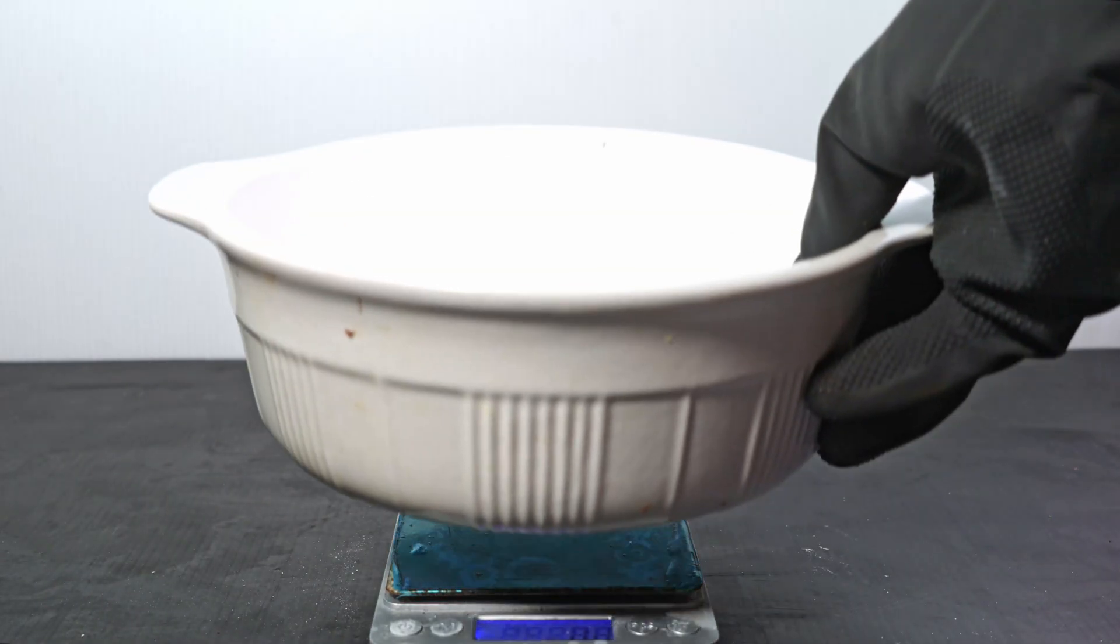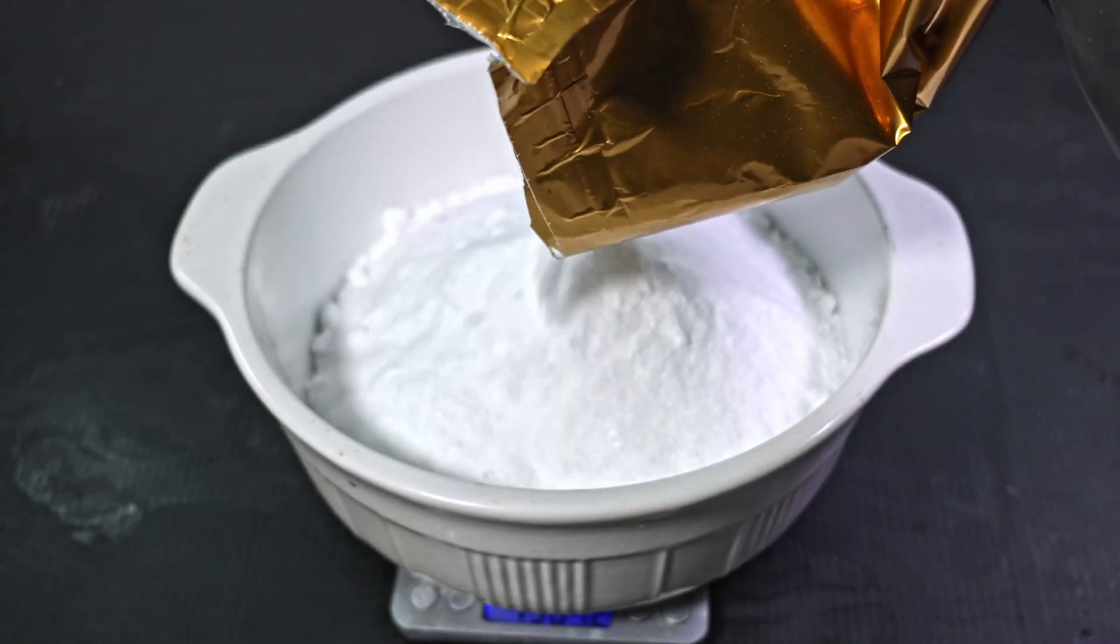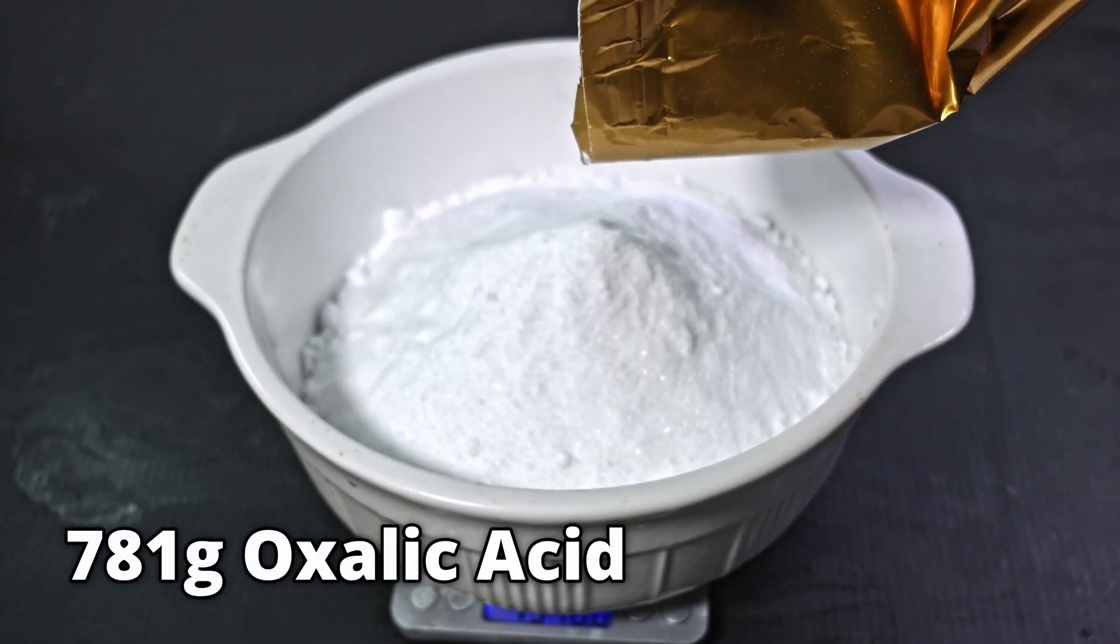Next, I'm going to try a heating dish. I first weigh it empty to get a baseline value. The weight is 1,195 grams. I add a little less than 2 pounds of oxalic acid, raising the weight to 1,976 grams.